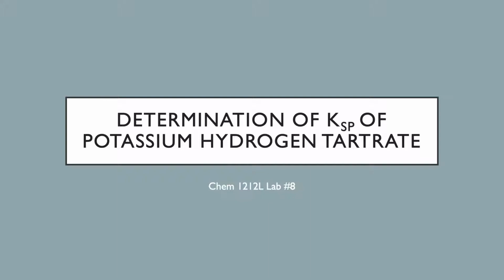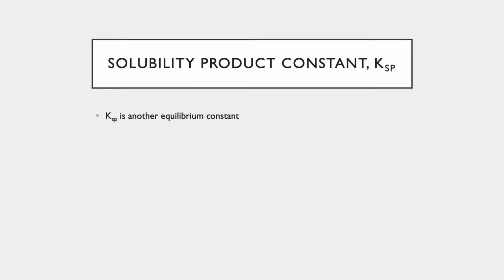And for this particular experiment, a lot of these ideas of talking about KSP or just the idea of titrations are not things we've done a whole lot of yet in the lecture, probably things we're going to be getting to in the next week or so. But KSP is still just an equilibrium constant, and a lot of the titration stuff is really just some more solution stoichiometry. So none of these things should really be too bad to adapt to upon seeing some of them maybe for the first time.